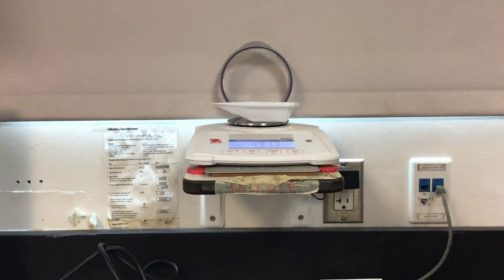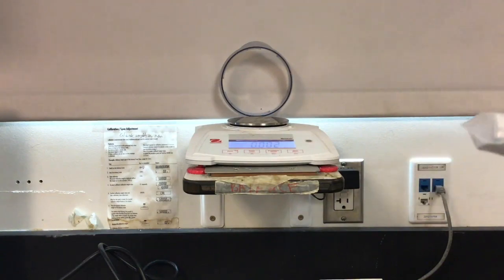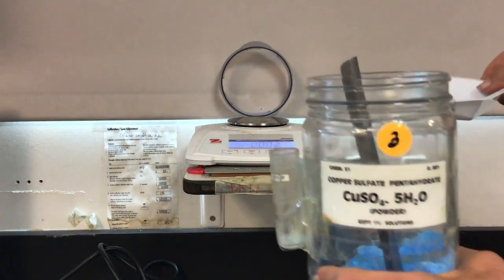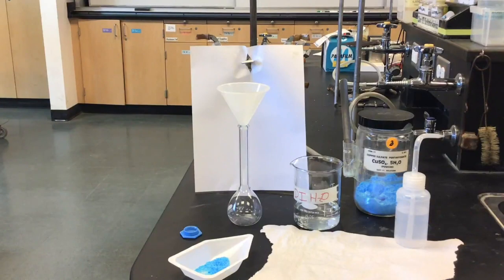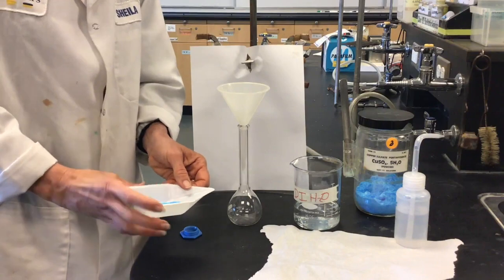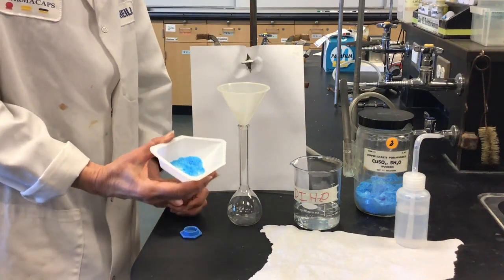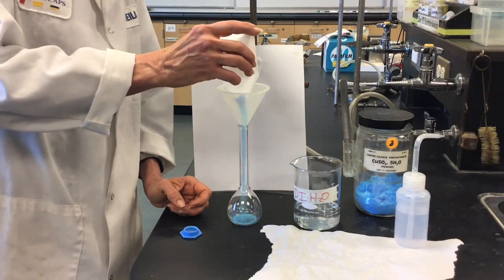Okay, so I have 4.916 grams. So I can calculate my mass of copper sulfate pentahydrate by going ahead and subtracting the mass of that empty weighing boat. Now we'll add our copper sulfate pentahydrate to our 100 ml volumetric flask.